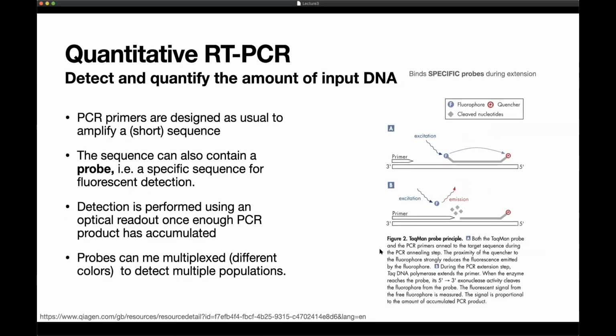This is actually not used that much for SARS-CoV-2 detection. There has been some literature on how to use it, and the primary concern with it is it's somewhat non-specific. So the second one is to use TaqMan probes, which means that you now have a third nucleic acid motif. So recall, this is the template you're trying to amplify and detect. You have two primers. You also now have a specific landing pad, or a probe, between these two primers in the sequence that you're trying to characterize.